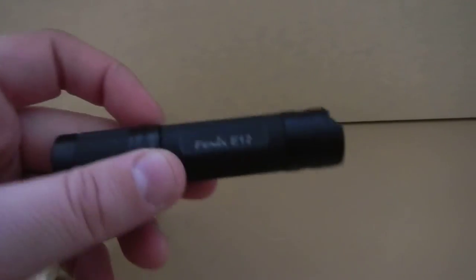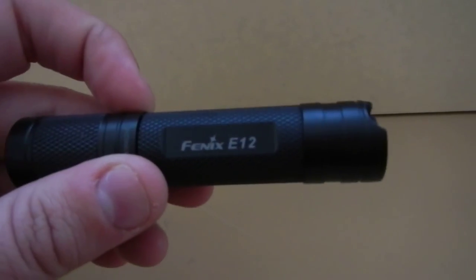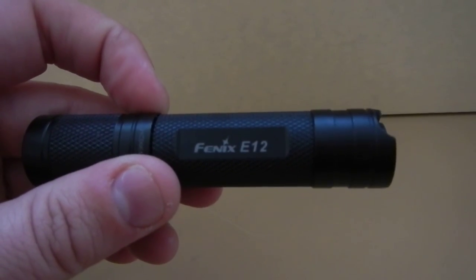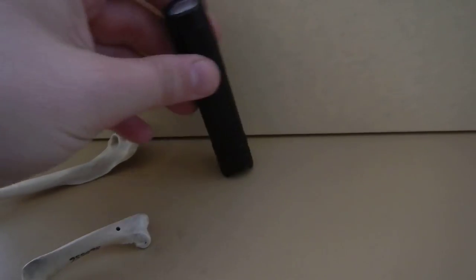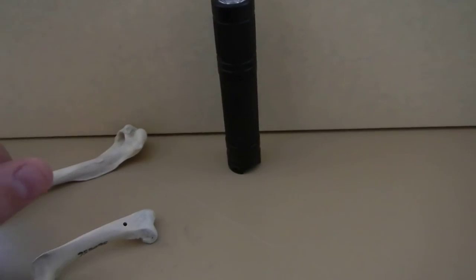For these smaller bones, I just use the Fenix E12. It's a pretty high candle power on the highest setting and it's pretty good for this sort of rapid assessment.